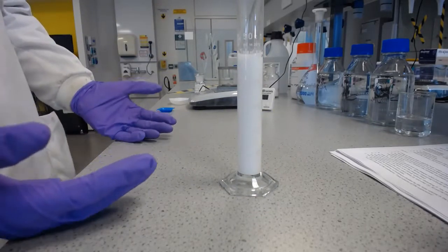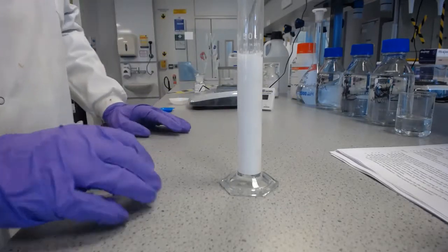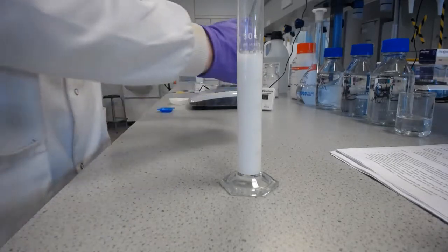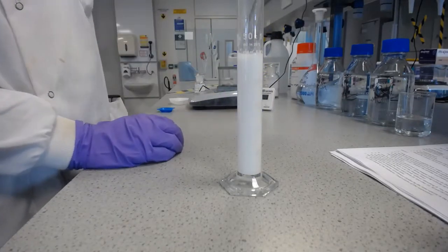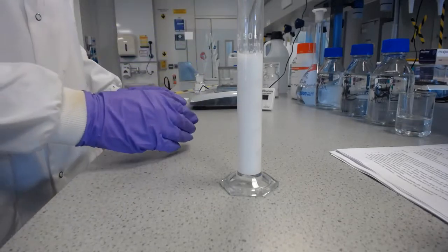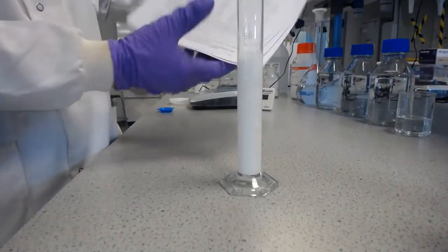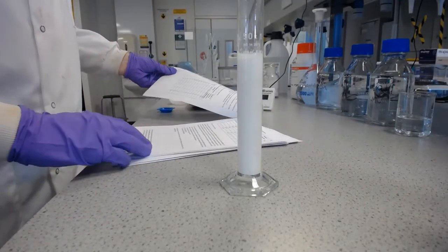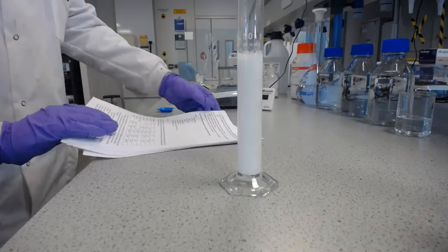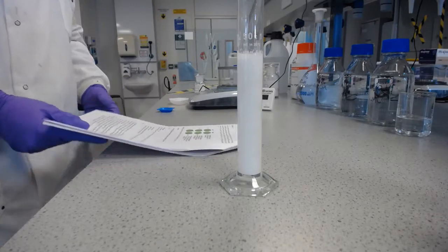I now need to repeat that process for the electrolyte strengths. Once they're all made, then they'll magically appear in just a second. We'll put them all next to each other and I'll put something behind them so you can see the difference, and then I will take pictures at the set intervals, which are at 10 minutes, 30 minutes and after an hour, I believe. Yeah, 10 minutes, 30 minutes and an hour.